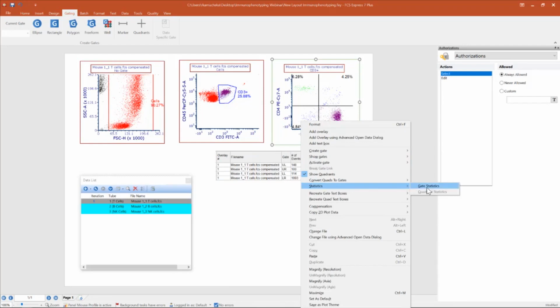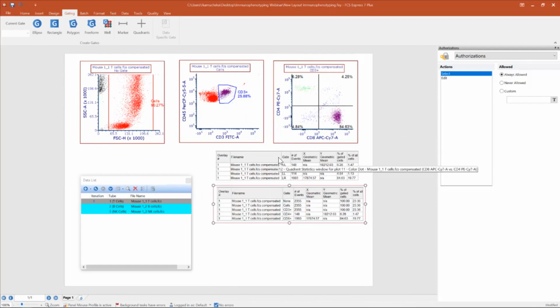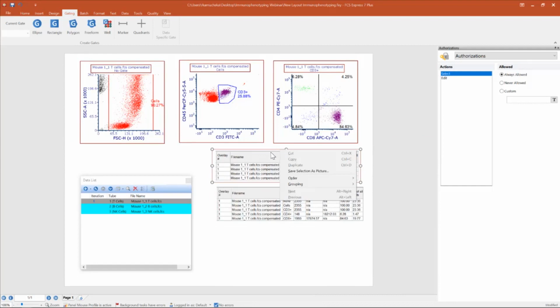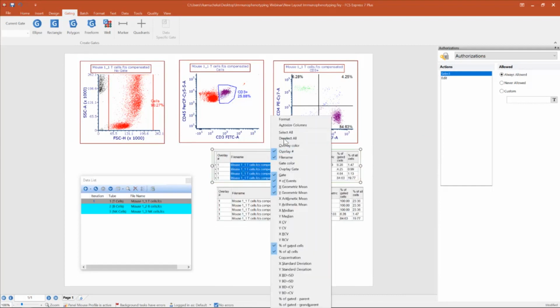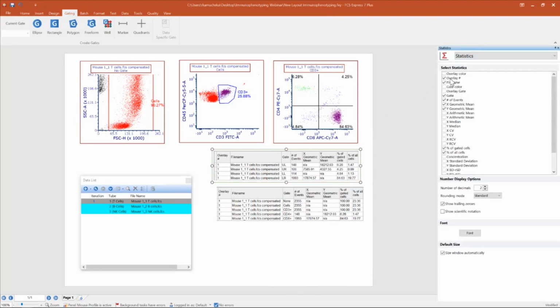As well as our gate statistics so that you can see how everything will update in real time. Now everything is formattable, so there's some default statistics that pop up. If we want to format any of that, we simply right click and we can deselect them one at a time, or using our format window, we can modify multiple statistics in one go.